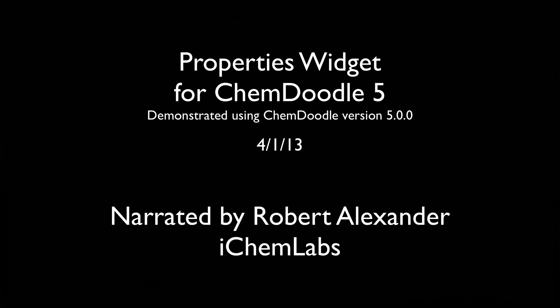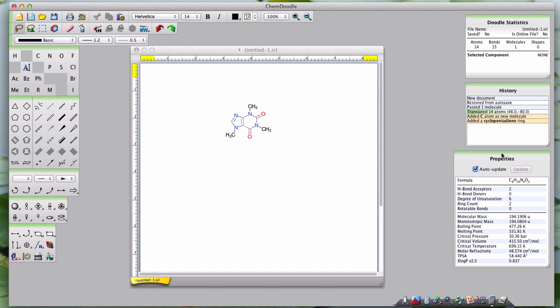Hi, I'm Robert Alexander from iChemLabs and this is the Properties Widget tutorial for ChemDoodle version 5. The Properties Widget calculates and displays descriptors for molecules.